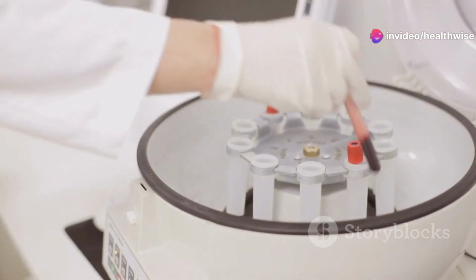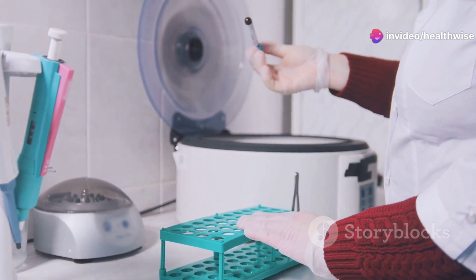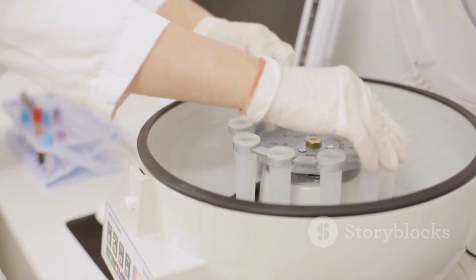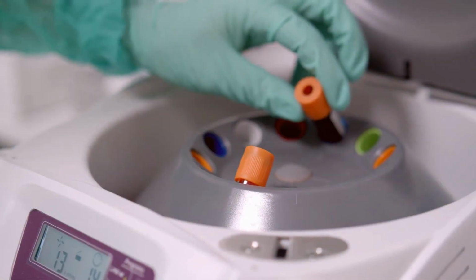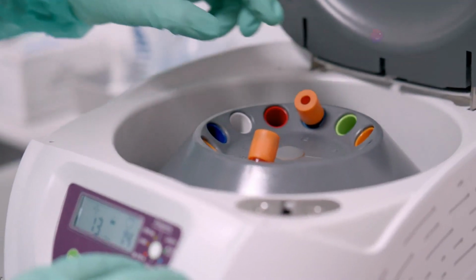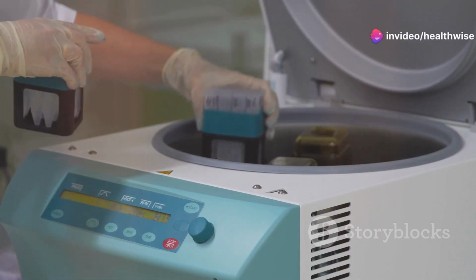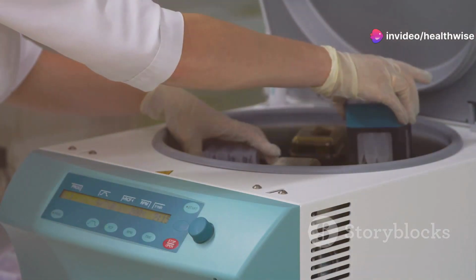Hey there, science fans! Today, we're diving into the world of the laboratory centrifuge. Now, this isn't your everyday salad spinner. This is a high-tech machine that uses the power of centrifugal force to separate different substances in a liquid. Think of it like a super-fast merry-go-round for tiny particles.